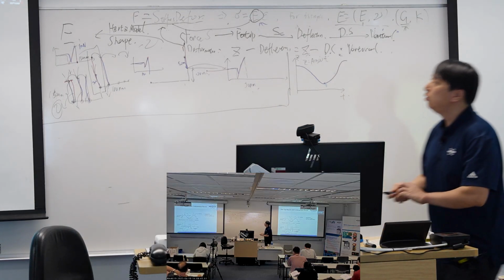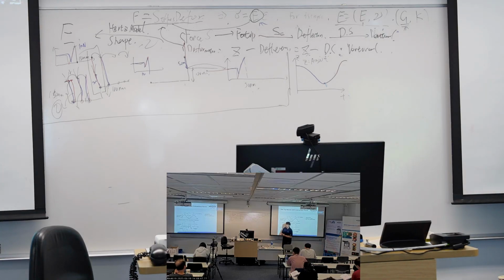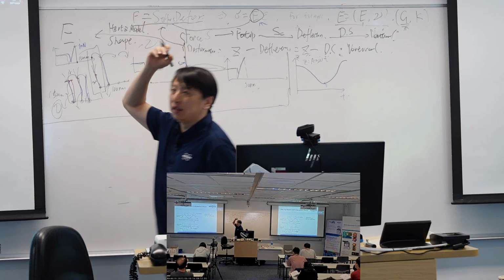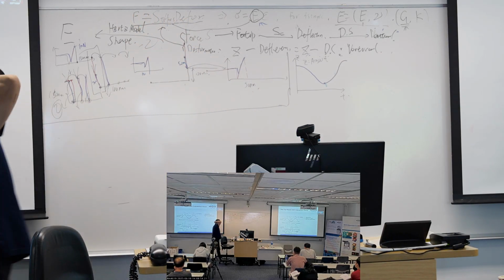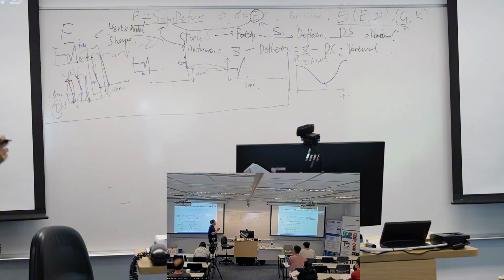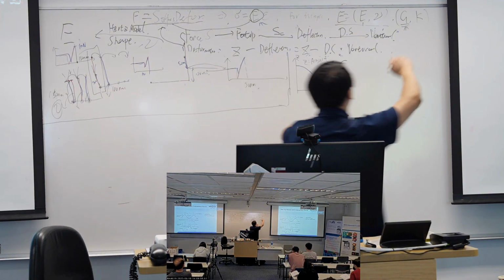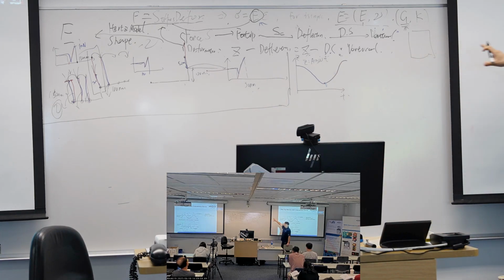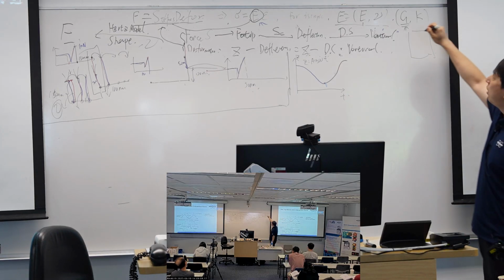Okay, let's continue with the imaging part. So our key idea is we apply the force curves and use the force curves to do AFM images. Basically, we just want to scan an area, and on each point of this defined area, we want to do a force curve.